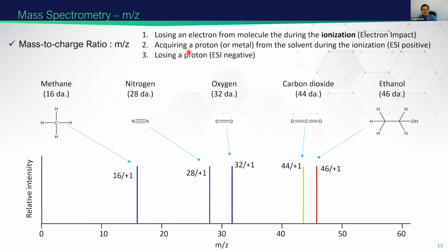In electrospray ionization, there are two modes, one positive and the other negative. If the molecule can get a proton, then overall the molecular charge state is +1. And if the target metabolite is an acid, it easily loses one proton and dissociates, for example, lactic acid converts to lactate. That process makes the molecule negatively charged.